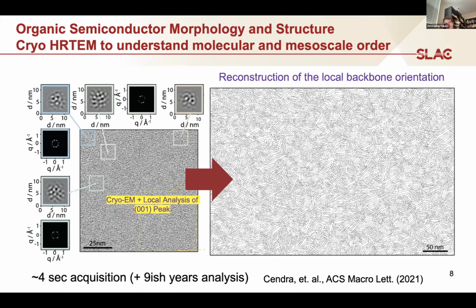And then bridging this into what we get with localized analysis based off of, in this case, wavelet decomposition methods in order to look at the local structure and the correlations thereof. In this case, this is a particularly challenging sample where I would say the majority of people would look at this and say that it's noise, but if you look at it long enough for many, many years, especially if you look at true random thermal fluctuations generated by the type of systems a lot of us study, you actually find out that it's not. And there's a lot of complex structure within these materials.